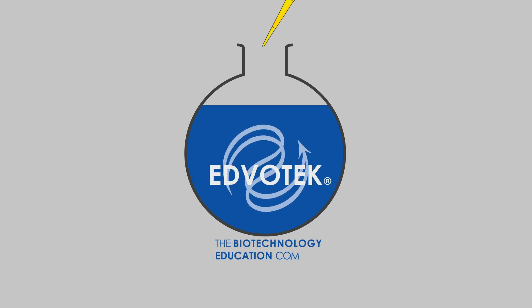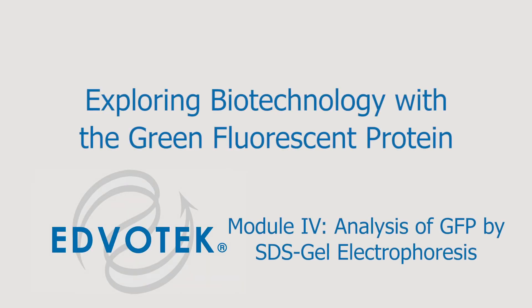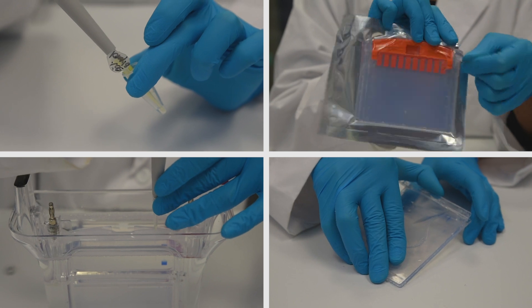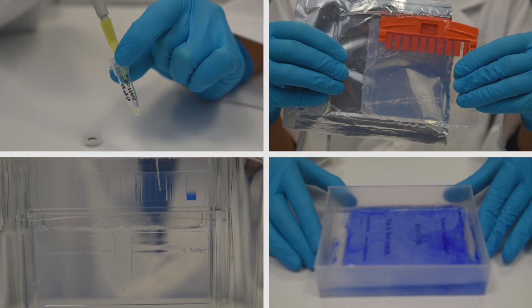Edvotech Instructional Videos presents Exploring Biotechnology with the Green Fluorescent Protein Module 4, Analysis of GFP by SDS Gel Electrophoresis. In Module 4, GFP fractions from Module 3 will be analyzed using SDS PAGE.